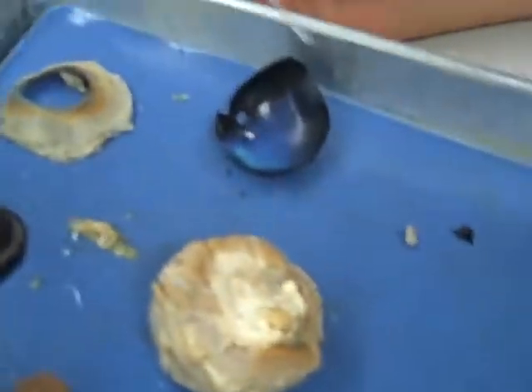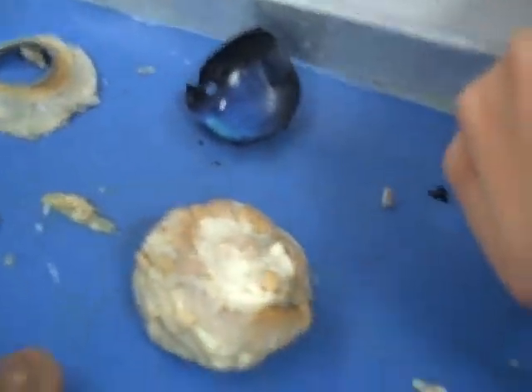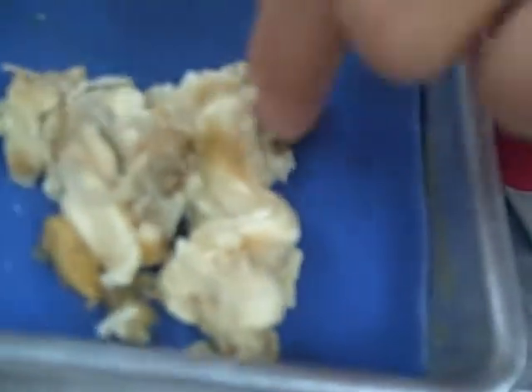Okay, this is our cow eye, and first we cut off all this fat stuff on the outside of the eye.